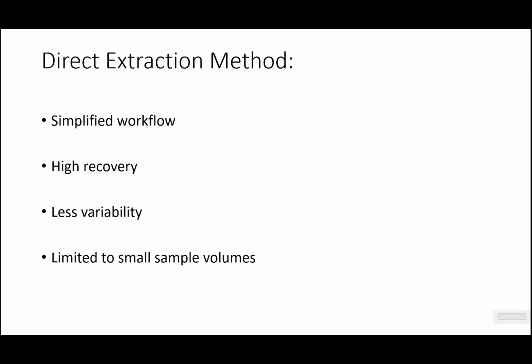The method also minimizes variability as a whole, as we saw in the last slide, and really the main disadvantage to this method is that you're limited to processing smaller volumes. That's going to equate to smaller concentration factors, which are usually on the order of 10 to 100-fold.